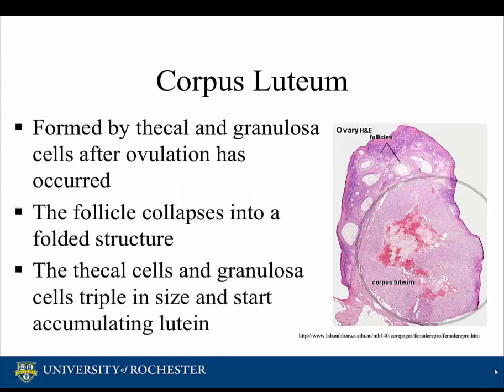The corpus luteum is formed by thecal and granulosa cells after ovulation has occurred, and is characterized by its folded structure. A few hours after ovulation, the thecal and granulosa cells triple in size and start accumulating lutein. On the picture, you can not only see the corpus luteum, but also a follicle.